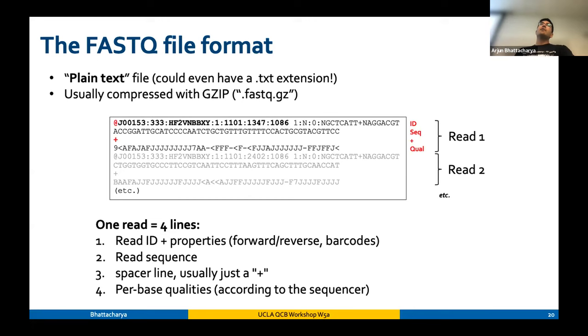But when you're thinking about annotations of new transcripts for long reads, you're going to have to go for like 60 million, 70 million, 100 million reads per sample. So it's dependent, again, on money, sample size, and what exactly you want to do with your RNA sample.